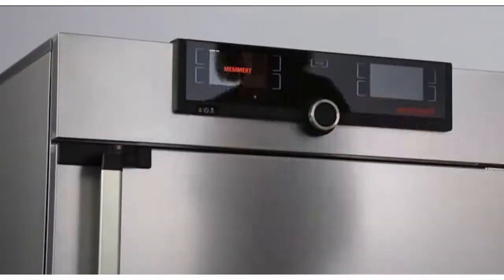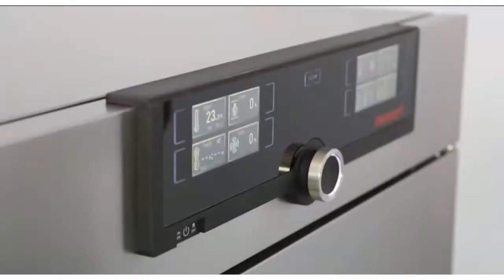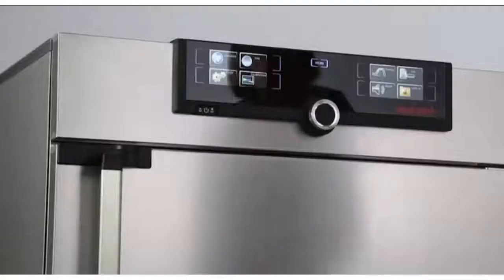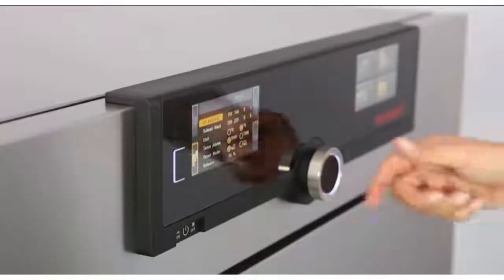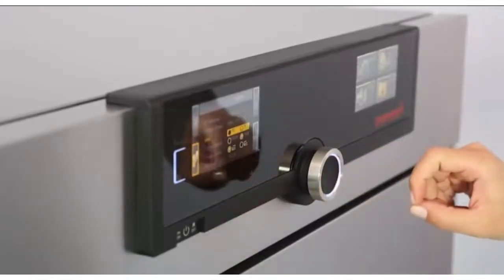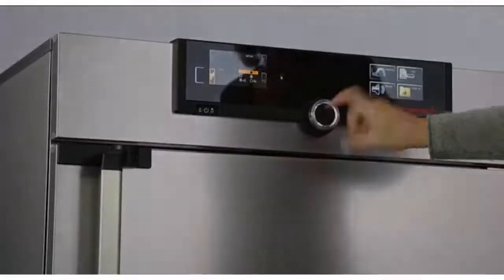Three quick steps and every function is ready. You prefer Fahrenheit or Celsius? There you go. Touch. Turn. And go. Was it ever easier to operate a heating oven?